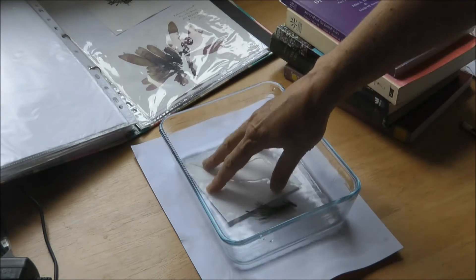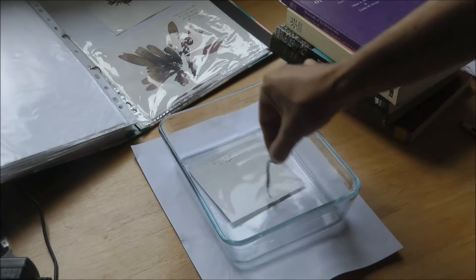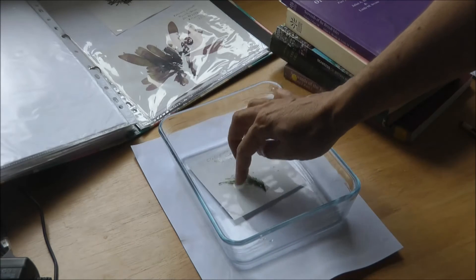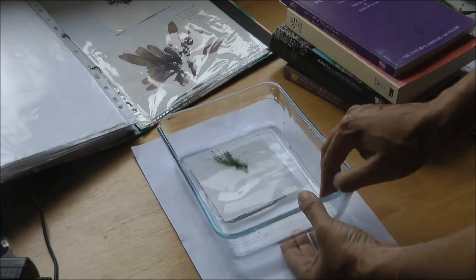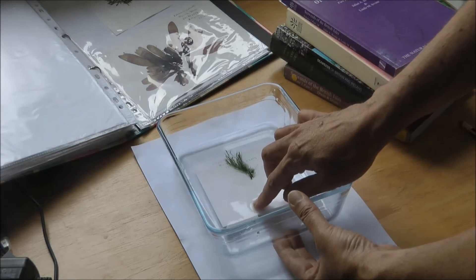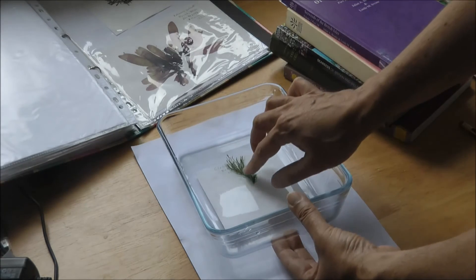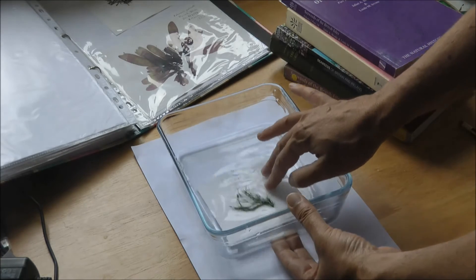That'll do. Then you can lay your seaweed on the paper. You then just need to tilt it so that there's no water at this end. We've got quite a shallow tray here, and now you can just move it up a bit.